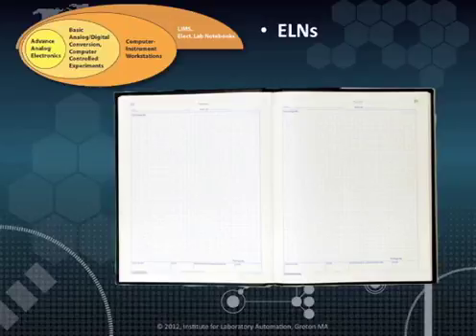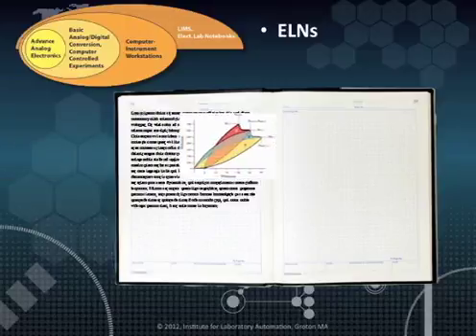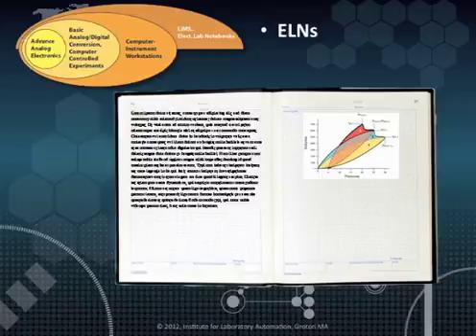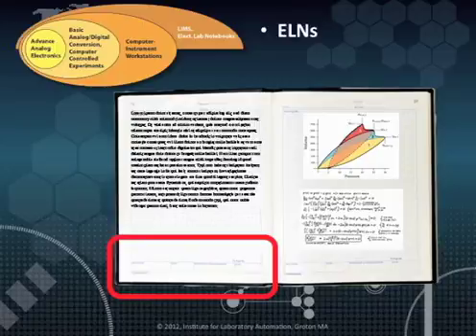First of all, they are used to contain all laboratory data. That might consist of handwritten notes, equations, drawings, as well as material printed from other equipment that is taped to the notebook page. On the bottoms of the notebooks there are spaces set aside for the signature and date of the person to whom the notebook is assigned, and also for the signature and date of the individual who is responsible for reviewing the scientist's work.